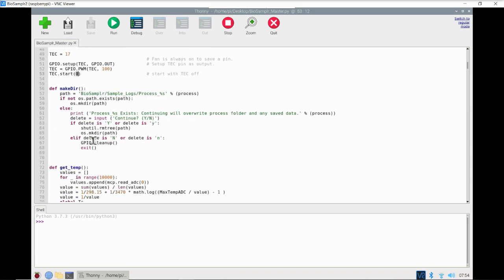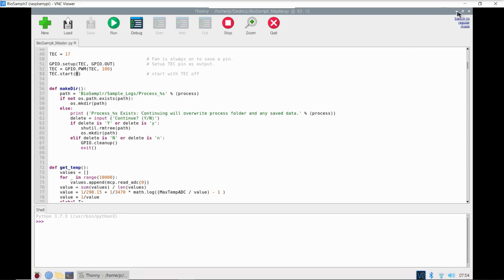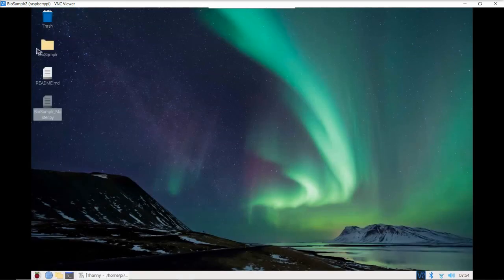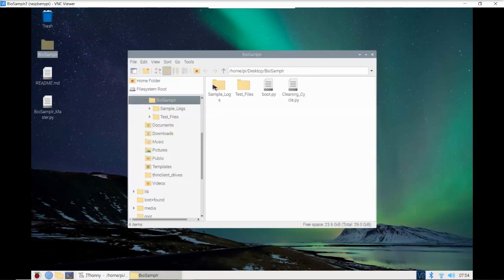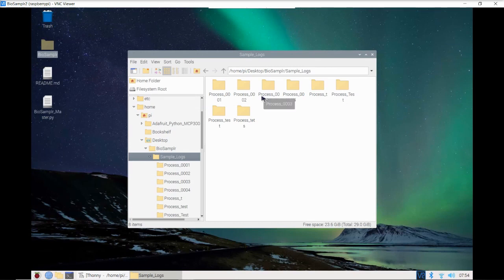Next we're going to define a couple functions. The makeDirectory function is going to set up a process log folder. If you go into your biosampler folder and sample logs, it's going to make a folder for your sample logs based on the unique identifier number that you enter when you start the process run.